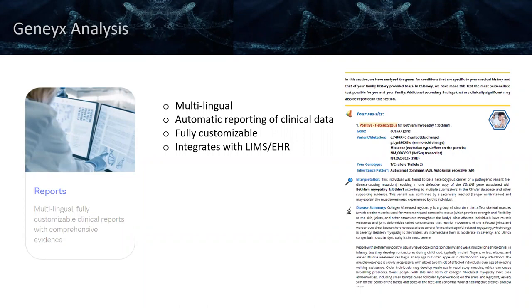They come in a variety of different languages, and they have the ability to automatically incorporate the clinical and patient data. We have a team that is dedicated specifically to performing customization on your reports. So if there's a particular lab design or brand design that you want to have implemented, we have the capacity to do that. And as I mentioned before, these can be easily integrated with LIMS or electronic health record systems.